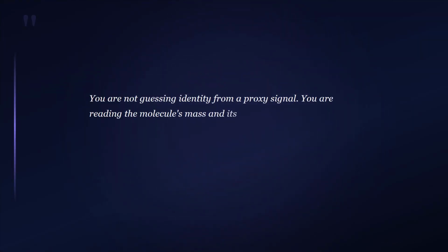And the reason that fingerprint is definitive, the reason it goes to court, the reason it replaces every other method in clinical confirmation, is structure. You are not guessing identity from a proxy signal. You are reading the molecule's mass and its fragmentation pattern directly.